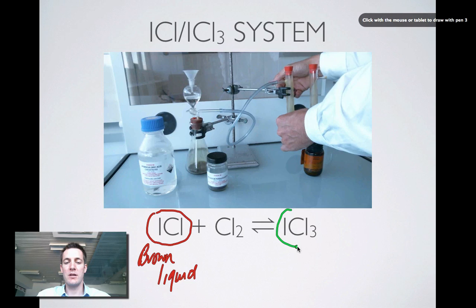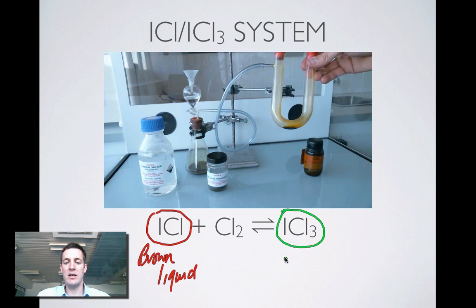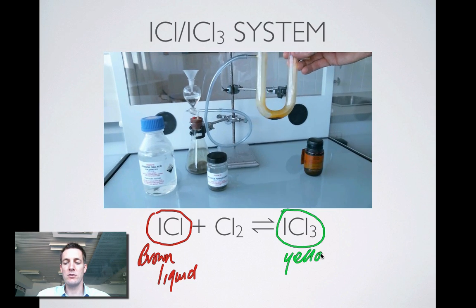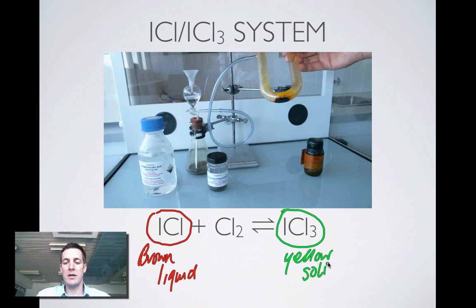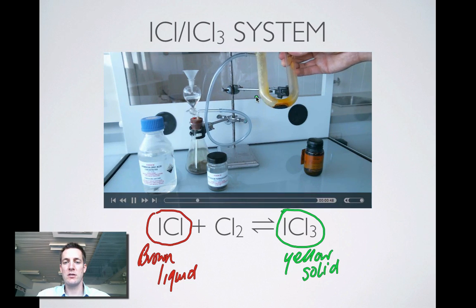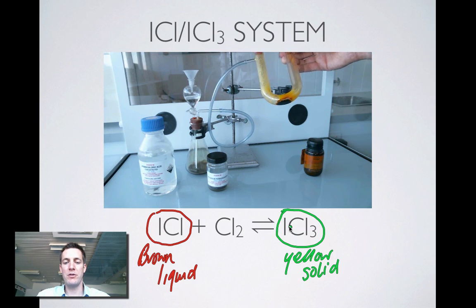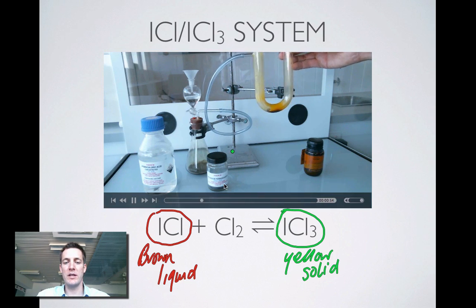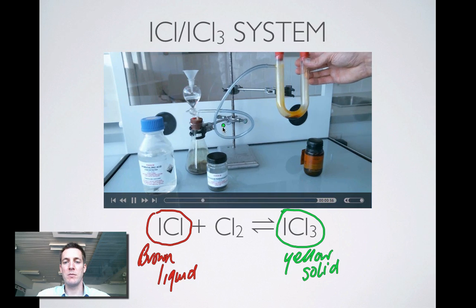How are we going to know if the ICL is turning into ICL3? Well, because we've got a yellow solid. So we're looking here at the tube, which has got a mixture of both things. It's got a yellow solid on the sides of the tube and a brown liquid down the bottom. So we've got both the reactants and the products. And we've got chlorine there as well because we've just made some in that flask.